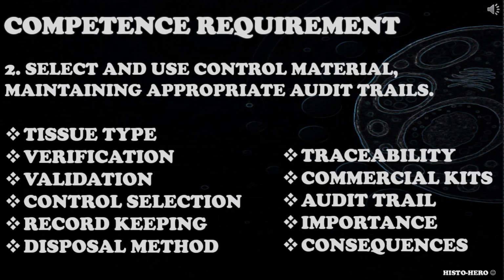The second competence requirement is select and use control material, maintaining appropriate audit trail. Candidate should be able to select and use correct control material. Does the candidate use correct control material? Do they maintain correct audit trail for control material used?